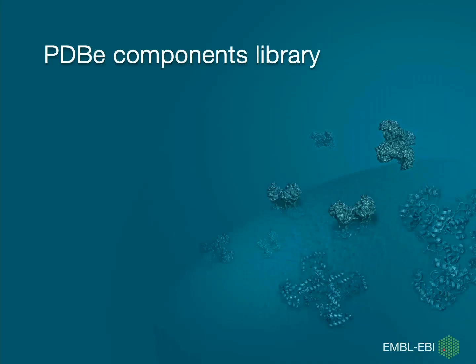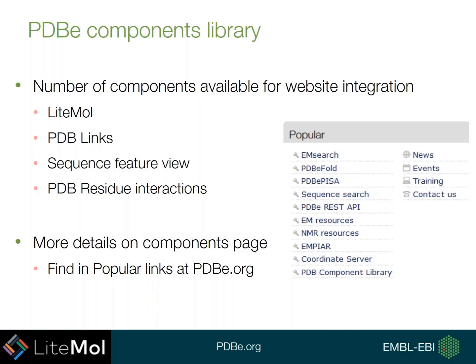The PDBe has built up a library of web components that can easily be integrated into your browser, and that is the PDBe components library. So there are a number of components available for this integration. This includes LiteMol, and you can easily integrate this into your browser.